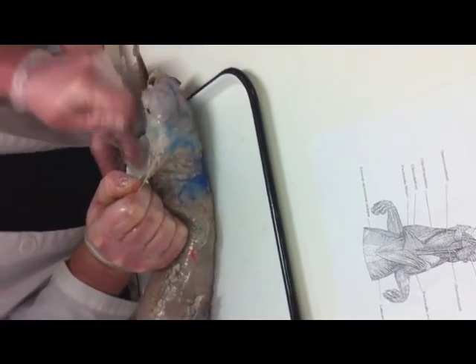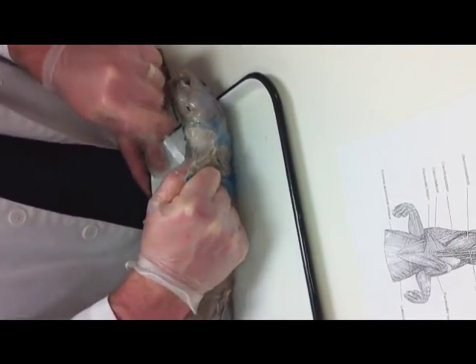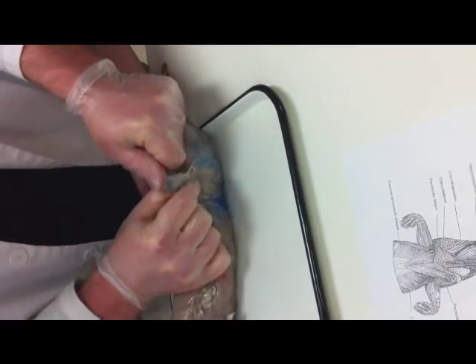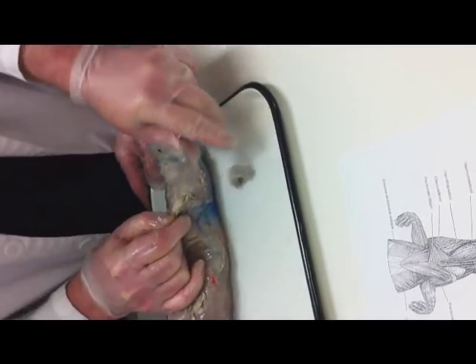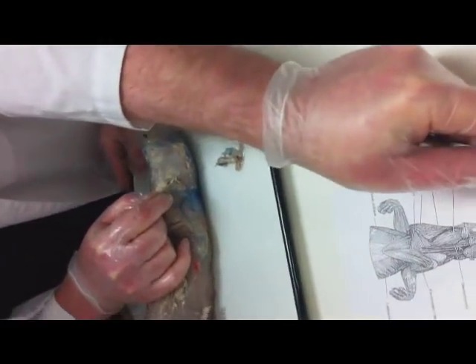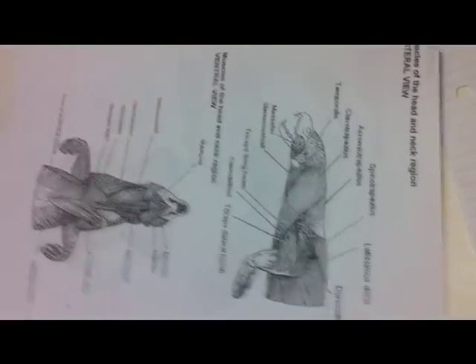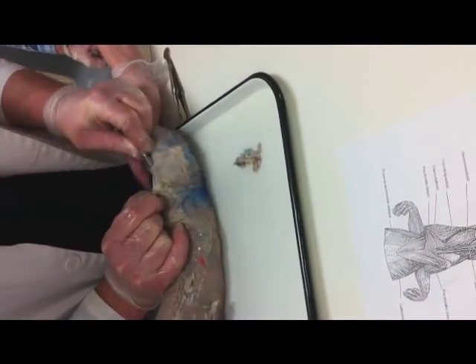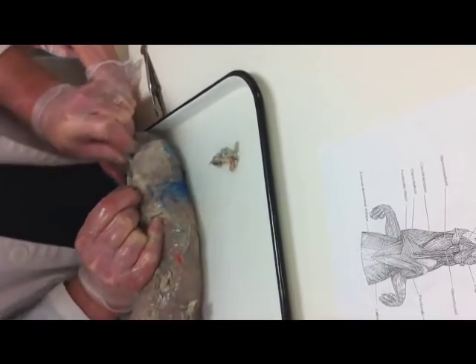Okay. So as I do this, I can see there's a large coarse muscle right here running down from the shoulder to the legs. There it is. And it's very large and very coarse. There it is there. And it's the clavotrapezius. So this large muscle here is the clavotrapezius. And as I probe over, I can see where it naturally ends, which is at that body of fat.